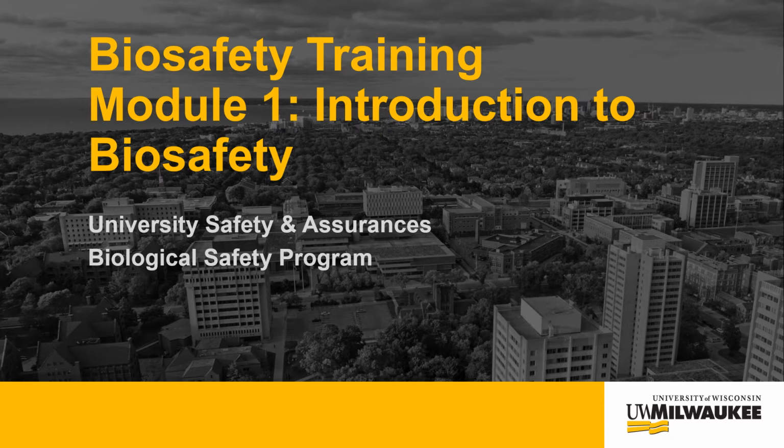Module 1, an introduction to biosafety, will introduce you to core concepts of biosafety at UW-Milwaukee, and an overview of the regulations and guidelines you are expected to follow when conducting research or teaching experiments involving biohazardous materials at UWM.